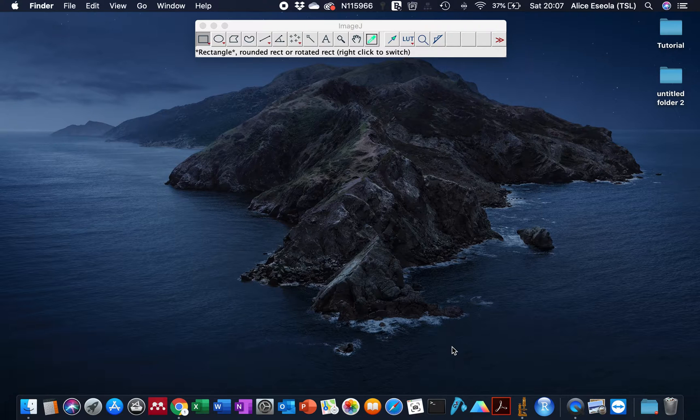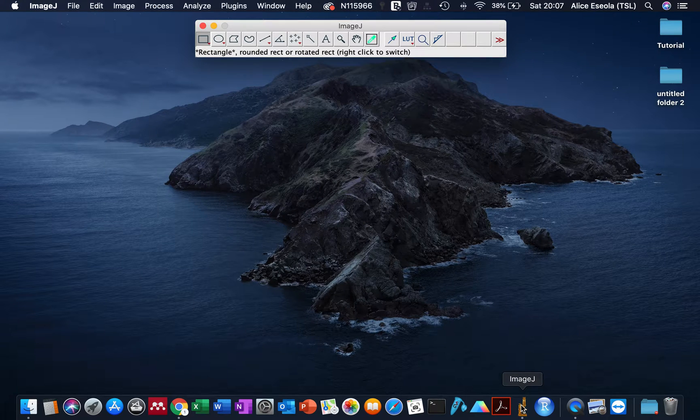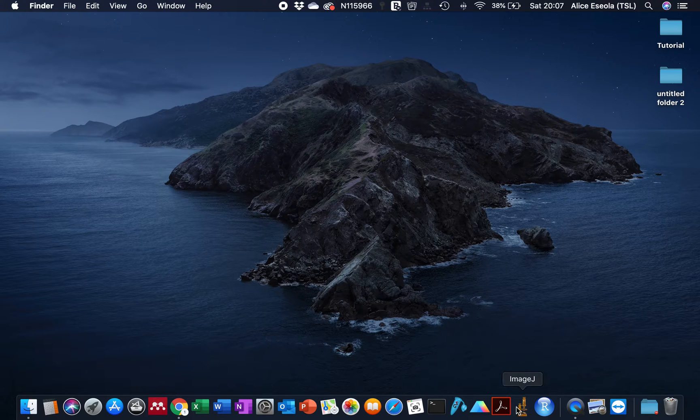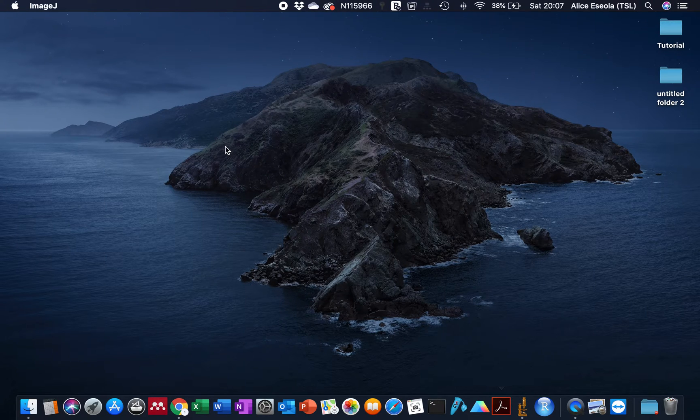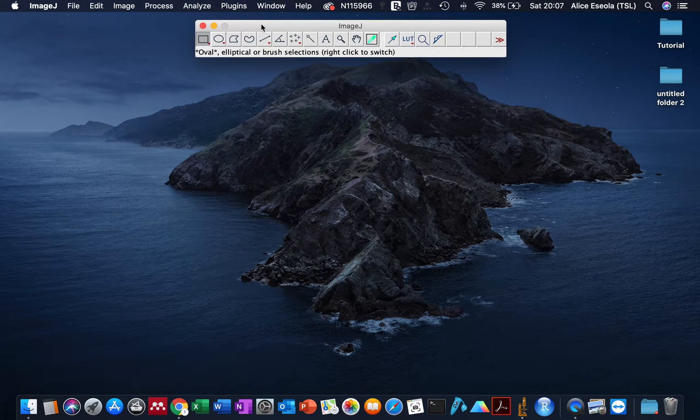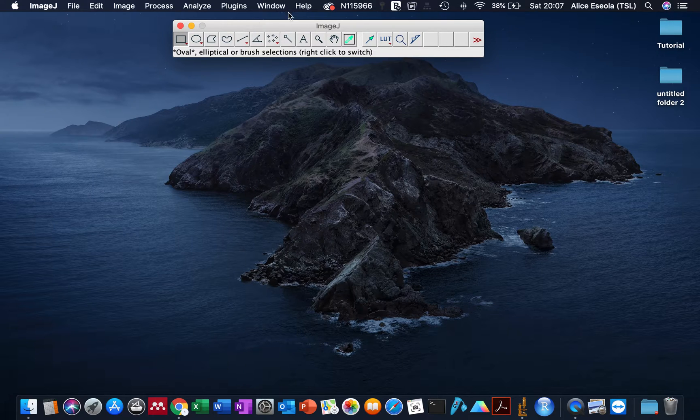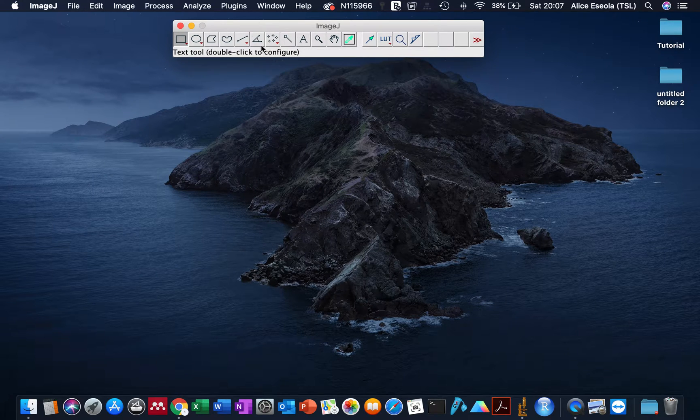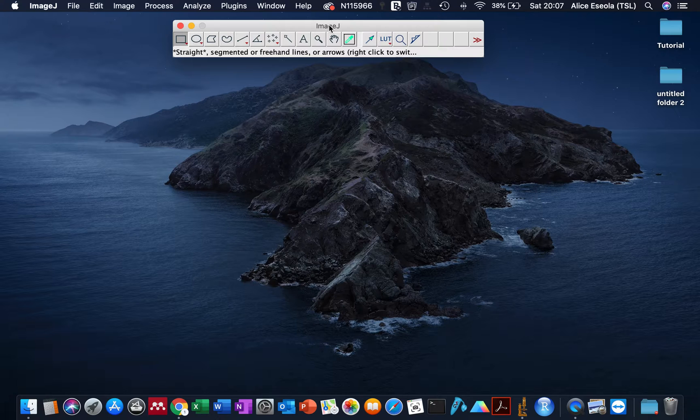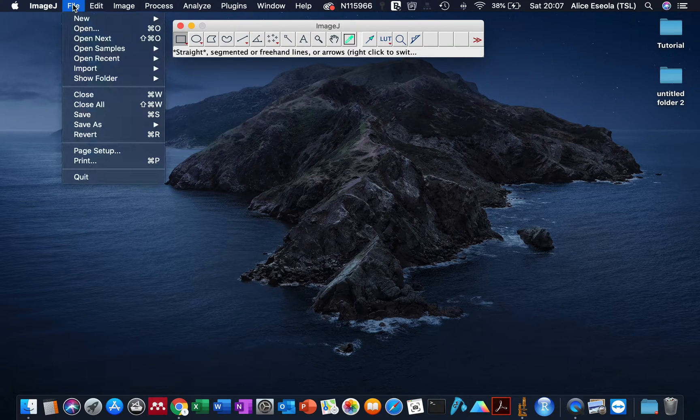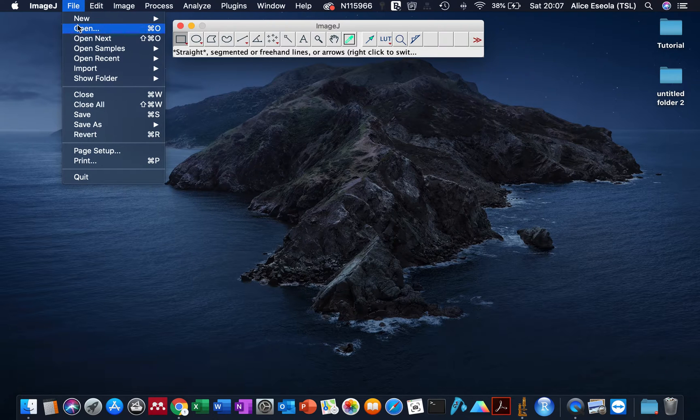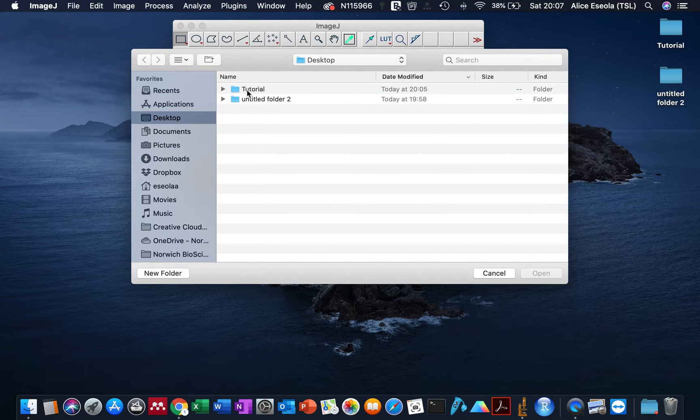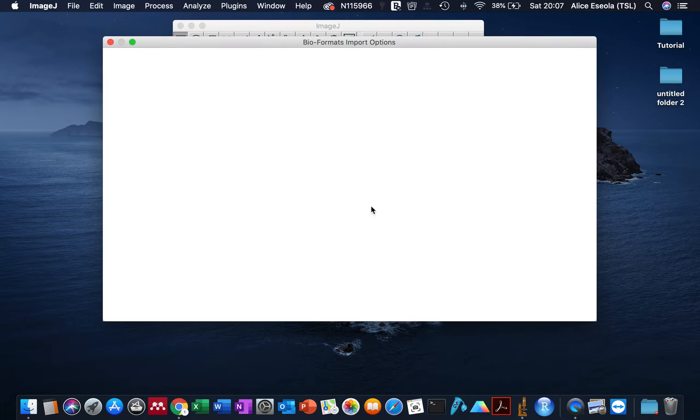Let's get started. We need to open our ImageJ software. If you're using Fiji, it's also okay. You click on it and there you have your ImageJ opened and ready for analysis. There are two ways you can open your image file. The first one is to go through File and use the Open function. There you can open your image.